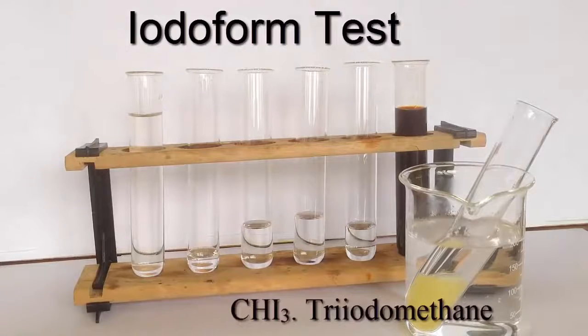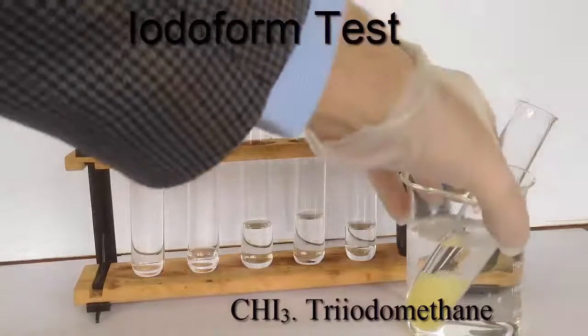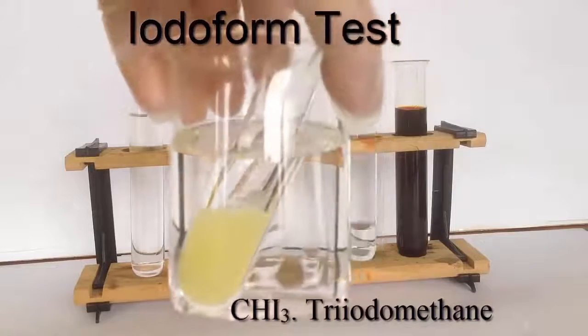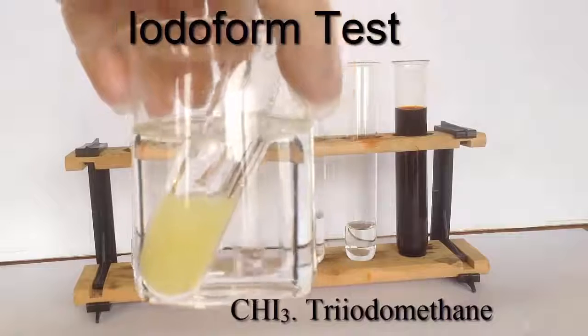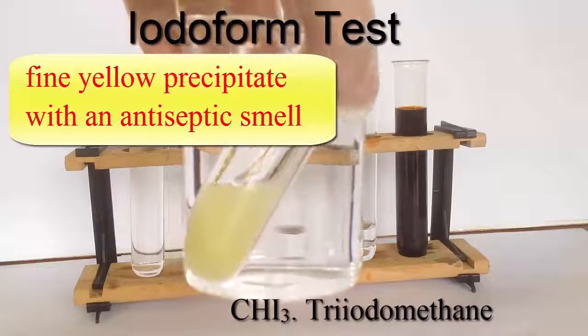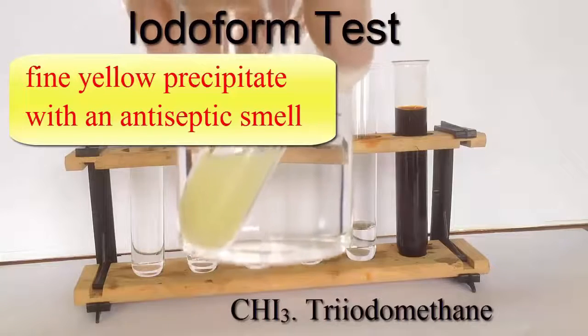And you can see what we've got here is a fine yellow precipitate. This is a positive test because we have produced triiodomethane. In there is a fine yellow precipitate, which you'll see at the end of the video when I filter it using vacuum filtration.